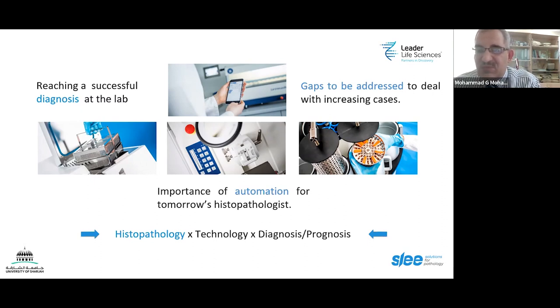The process might take from taking the biopsy to getting the diagnosis 2 to 5 days, depending on the setup. Sometimes, if there is a problem, you need to do it again, which means another 2 to 5 days. It prolongs the process. So here, the automation is very important. And definitely, the manufacturers really appreciate this kind of thing, and they're looking into it precisely to be sure that these instruments are going to produce standardized output.